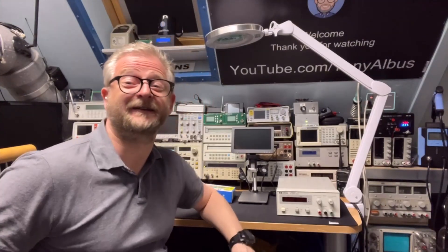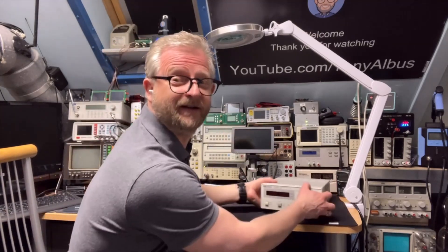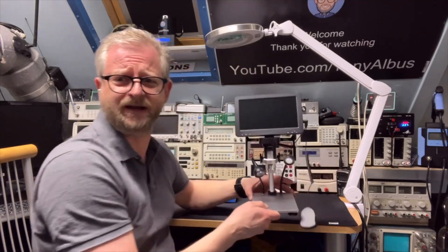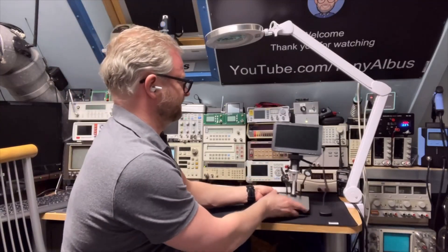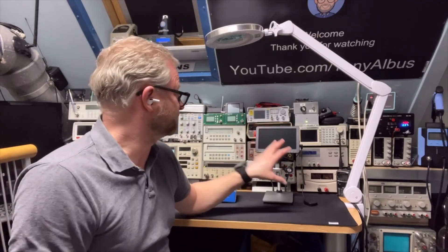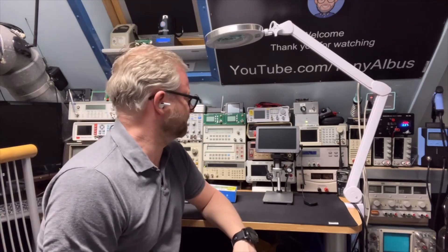Hello and welcome back. I had a lot of views on this microscope — it's about 7 to 9 inches, quite big. And it is cool because you can use it immediately without anything. But it starts at around $50, so for some that could be a pretty significant amount.